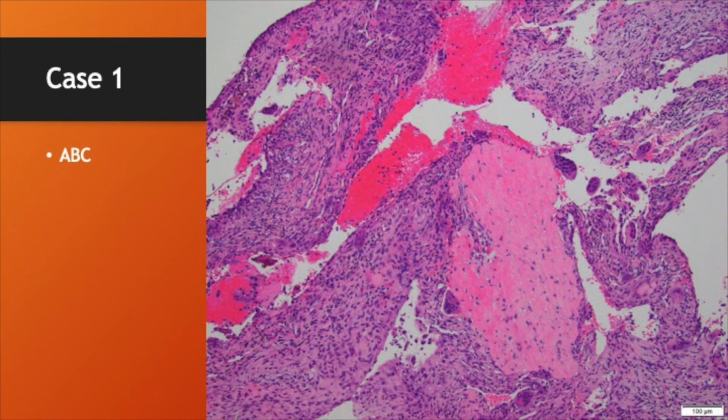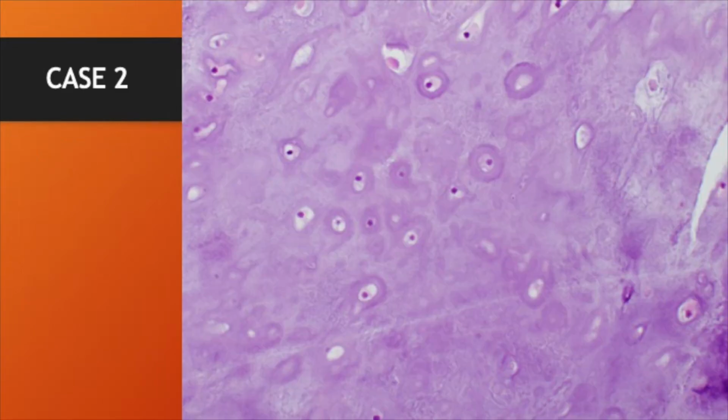When you first looked at this, I'm sure that was very far from the differential diagnosis in your head. So again, you have to slow down and start with the algorithm, but there are a couple of key points in the algorithm where you could go very wrong. You have to be careful in what you're looking at and be able to recognize that. If you're having trouble, or you keep getting the same errors as you go through questions, then reach out to me and let's go over it, and I'll be able to tell you what you're not seeing or where we're going wrong. All right, case number 2.